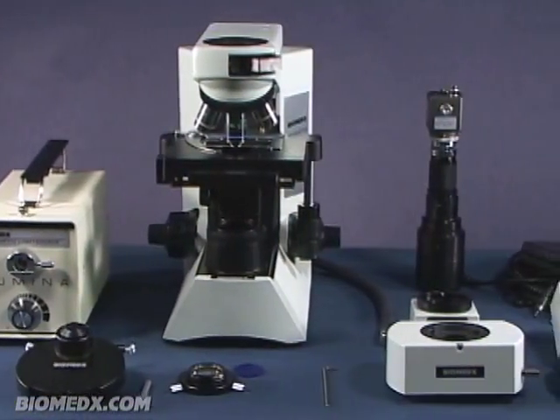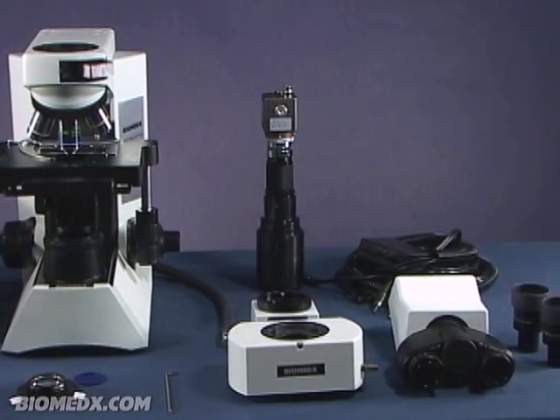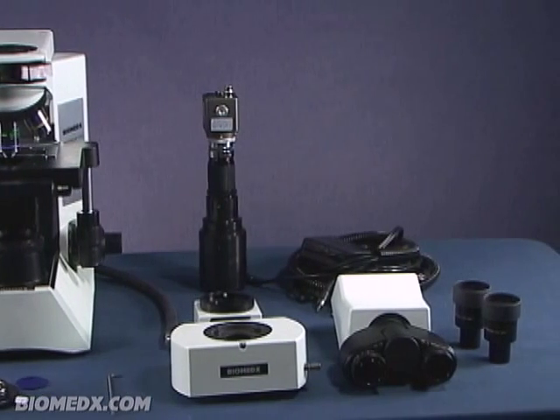When you first get your microscope, it will be important to initially take everything out of the boxes and lay them out on a table. From there, you can start to assemble the components. At this very early point, I feel I should make one important point: when you are home alone or at your clinic and everything is spread out on your table, should all else fail, you can always read the instructions.